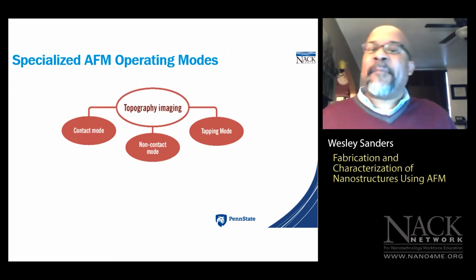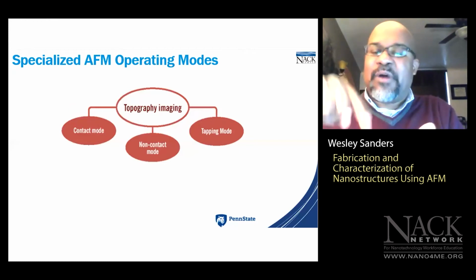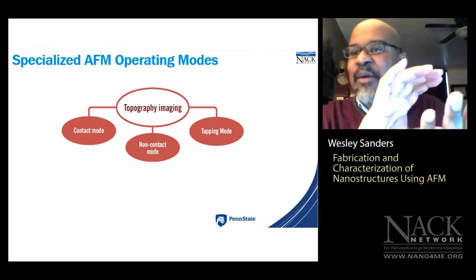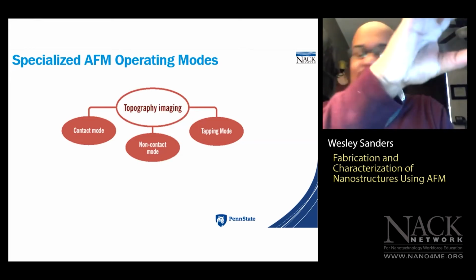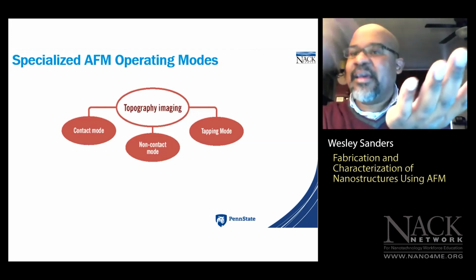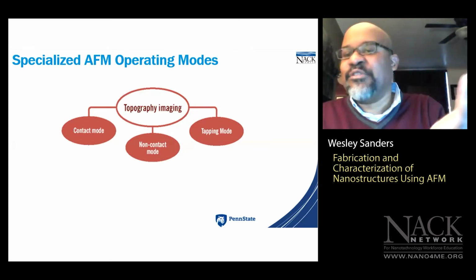Right. So I do know that there's this technique known as laser-induced desorption, where you use the laser beam directly to break chemical bonds between an adsorbate and a substrate. So your adsorbate is like an alkanethiol molecule, like I discussed before, and then you have a substrate. Your molecule is attached to your substrate via chemical bond. With laser-induced desorption, the laser comes in and breaks that bond. So you can basically do the same thing. You can etch patterns in your substrate or in your thin film using the laser.